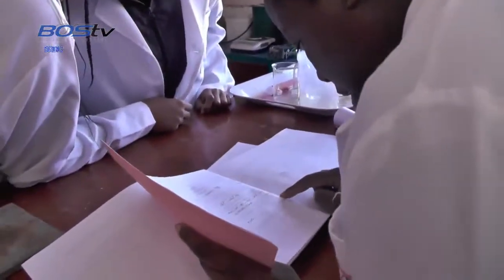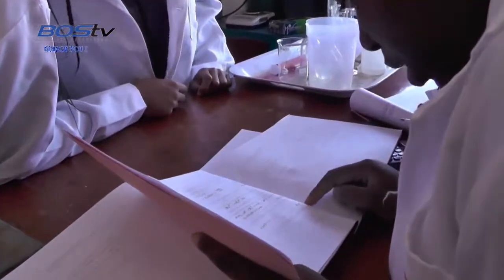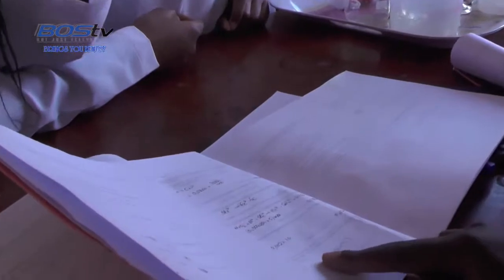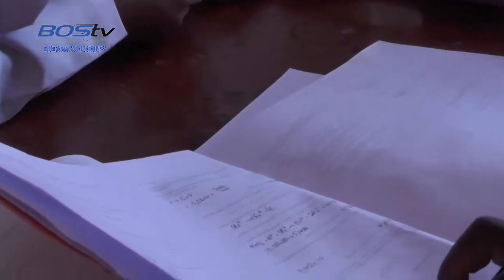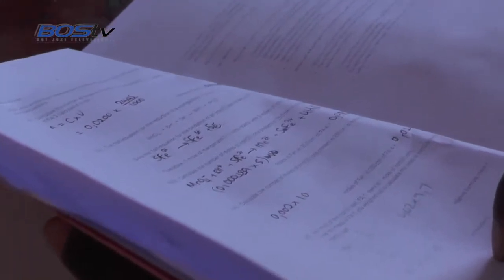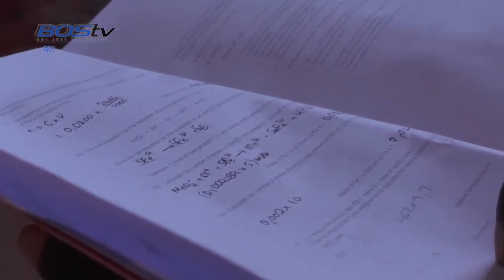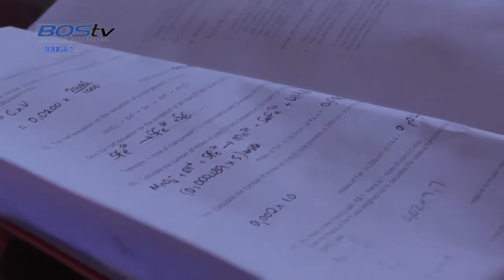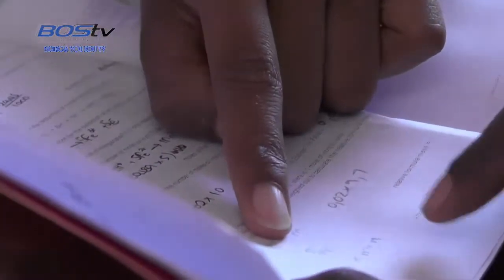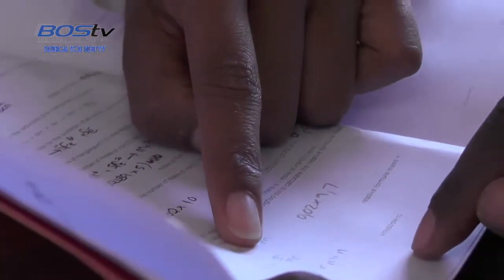Calculate the moles of ions present in 250. You multiply by 10. And 1 mole of iron 2 salt FA1 is 1 mole of ions. Use the mass of FA1 you weigh to carry out. And it's supposed to be like this. Yeah, no. We used the last one. No, wait, it is like this.